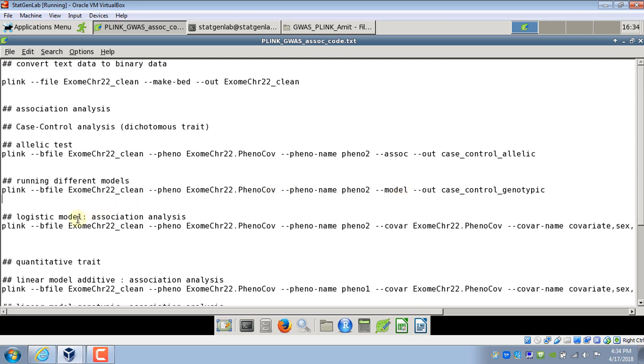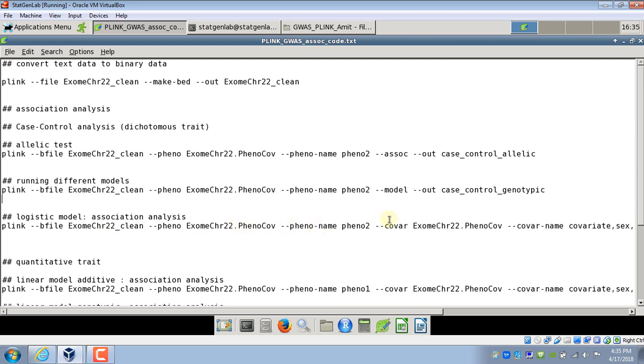Now if we have outcome which is dichotomous we can also perform logistic regression in Plink. And one advantage in logistic regression is now we can add covariates into the model. So as I showed you before I have some covariates in the same file exome chr22 pheno co. So I will use some covariates into this model. So up to this part with phenotype file and phenotype name everything is same as before.